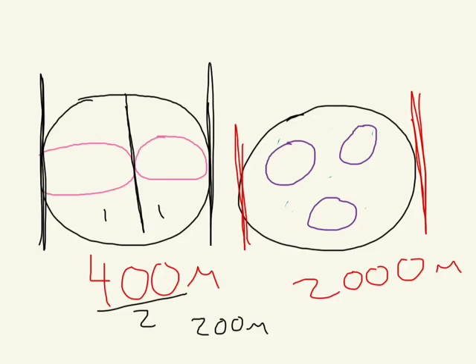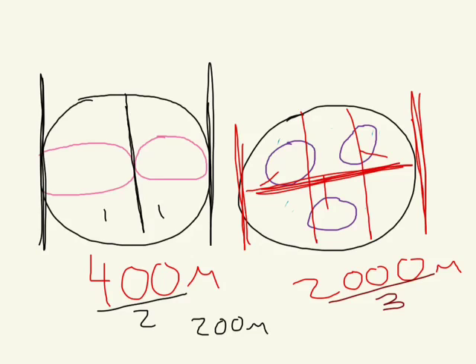2,000 microns. Well, if we look at each one of these, we could say that pretty much if we took this one here, put this one in the middle, and put this one over there, it would stretch the entire span of the field of view, which would mean that we'd cut it into thirds. So having 3 equal parts means we would divide the 2,000, the whole field of view, by 3, which would end up coming roughly to 660, call it 667 microns.